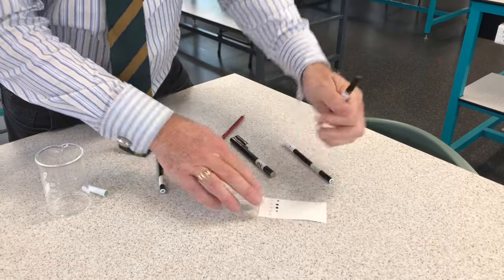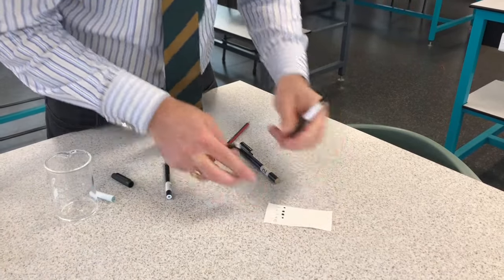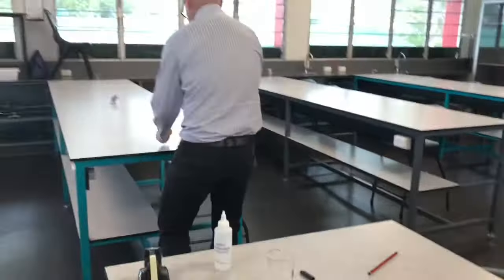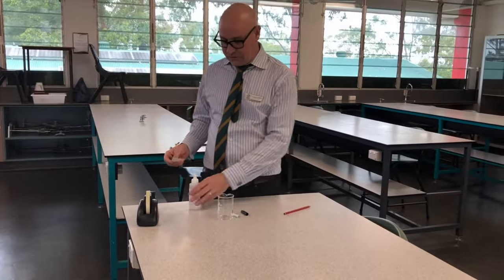Now I'm going to sneakily, without showing you, make one of these the crime scene pen - no peeking!